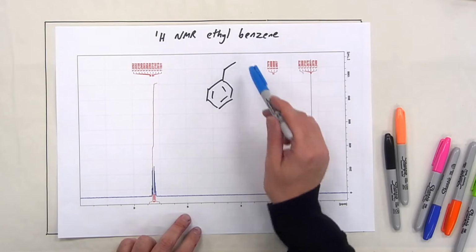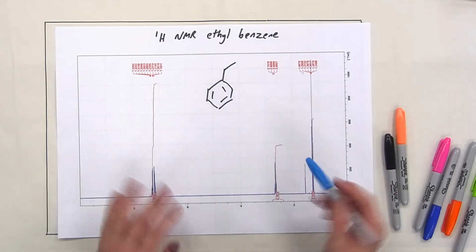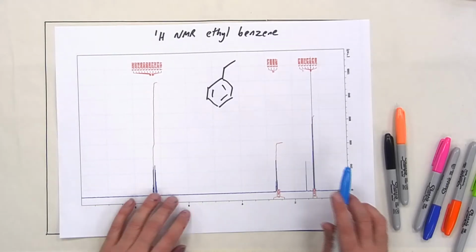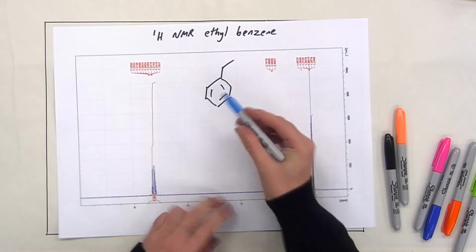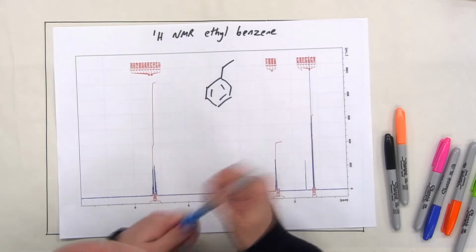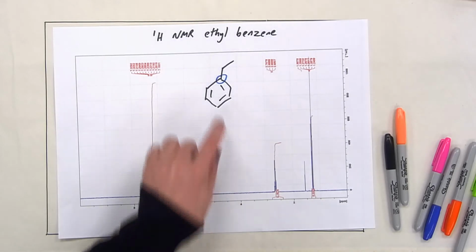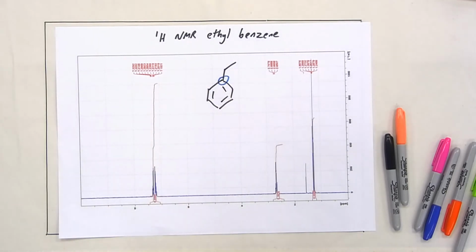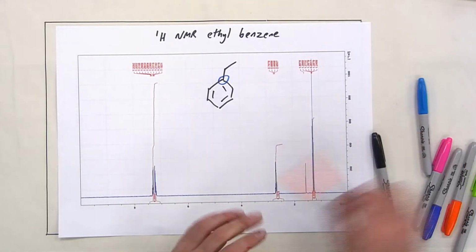So we've got essentially, as you've seen, the CH2, the CH3. So first things first is we've already seen there are 6 resonances in the carbon spectrum, and well, there may be less in the proton. The reason there's less really is that this carbon here is not attached to any hydrogens. Okay, so that carbon it's already got 4 bonds, so it won't have a hydrogen.